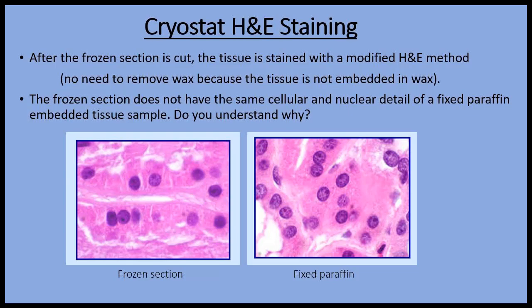These images are from the same sample of tissue, which is kidney. The one on the left is from a frozen section and the one on the right is a section that has been fixed and paraffin embedded. Can you see the difference in nuclear and cellular detail in these two images?